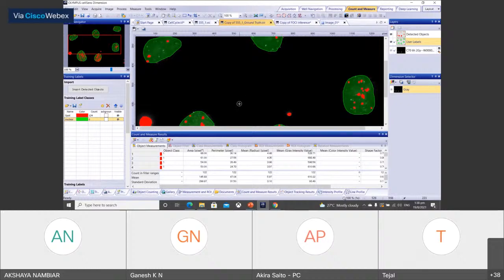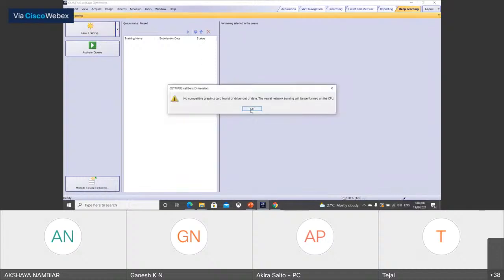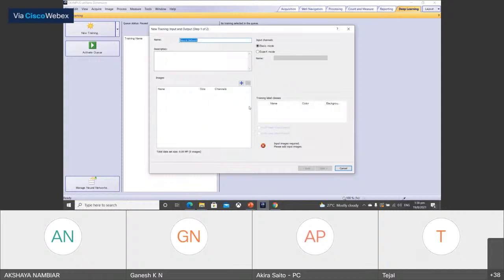So once the labeling is done, we can go to deep learning UI and create a new training.